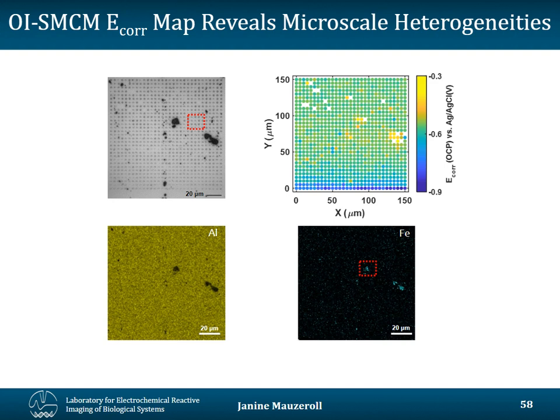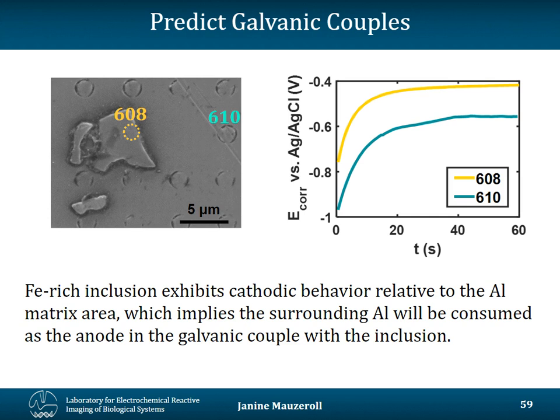potential dynamic corrosion curve. You can see that the dark inclusions on the aluminum alloys actually show different corrosion potential on the top right-hand corner map. The areas in yellow have a very different corrosion potential compared to the rest of the aluminum matrix. And so this type of measurement can rapidly identify what feature is going to lead to corrosion initiation or be subject to microgalvanic coupling, which is also detrimental.